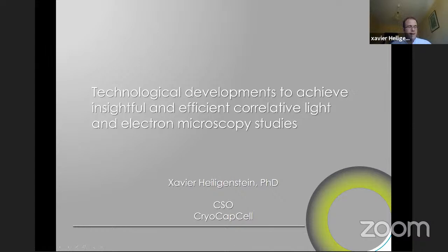So as Pablo just said, my focus is working on technological development. When I started my PhD, the main problem I faced was that the technologies I needed to answer my questions did not exist. So I decided to create technologies for my PhD. This was the Cryo Capsule, and I will not go too much into the details of that.